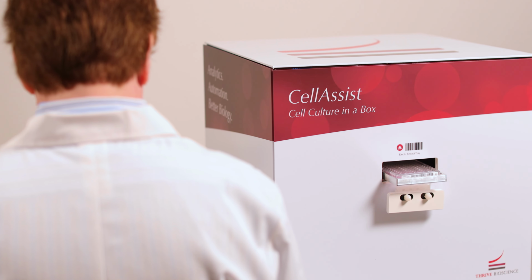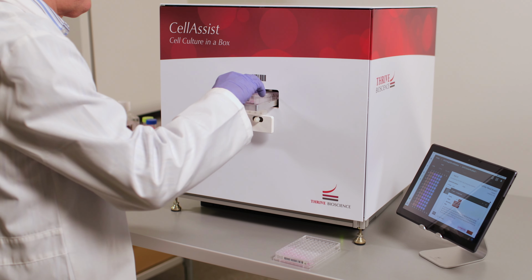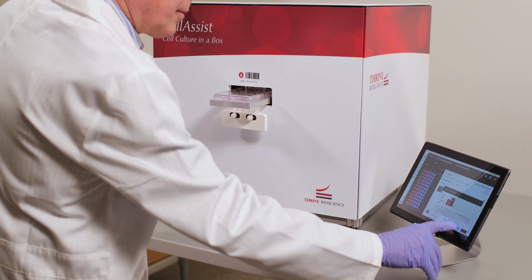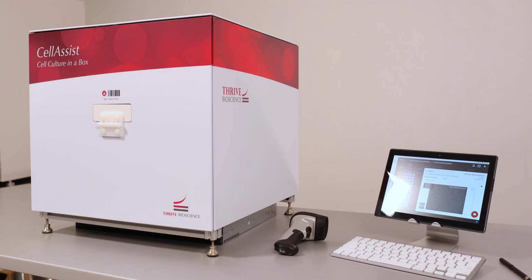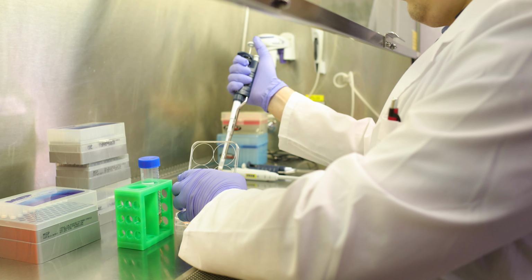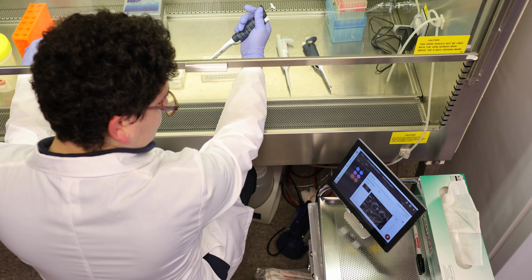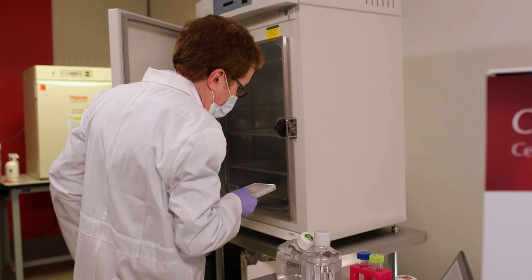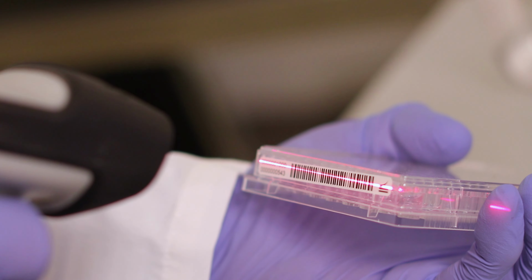With state-of-the-art imaging, advanced analytics, plate management, and laboratory tracking, from initial plating through final analysis and publishing, researchers are turning to CellAssist for the accuracy and repeatability that is essential for modern research. We're proud to be helping biologists worldwide get the most out of their research. We look forward to finding out how we can help you get the most out of yours. What can CellAssist do for you?